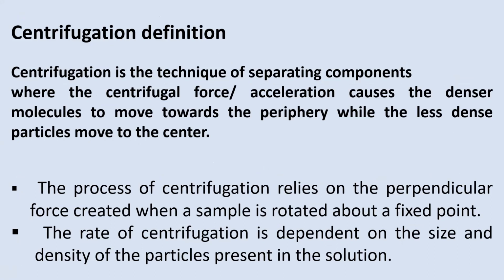It is a technique of separating components where the centrifugal force, there are two types of forces, the centrifugal and centripetal. So centripetal is actually towards the center, centrifugal is away from the center. Acceleration causes the denser molecules to move towards the periphery, while the less dense particles move to the center.